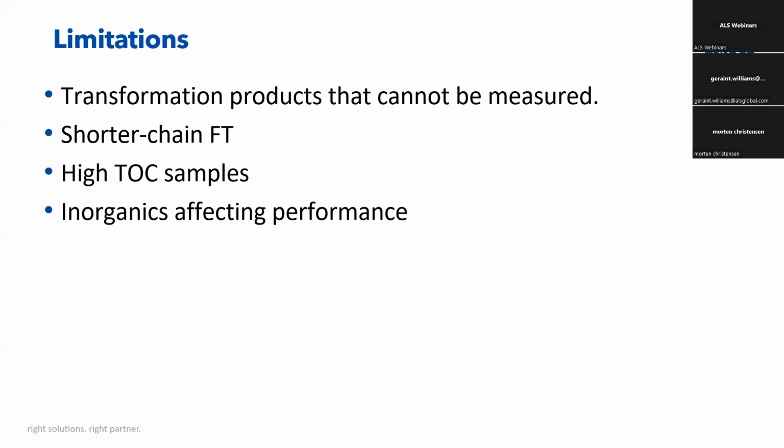But if we were able to determine these ultra shorts as part of TOP assay, I think there's been some research out there, mostly at an academic level, which do show much higher yields if you are able to determine things like trifluoroacetic acid and some of the other ultra shorts. So that's just maybe worth being aware of.